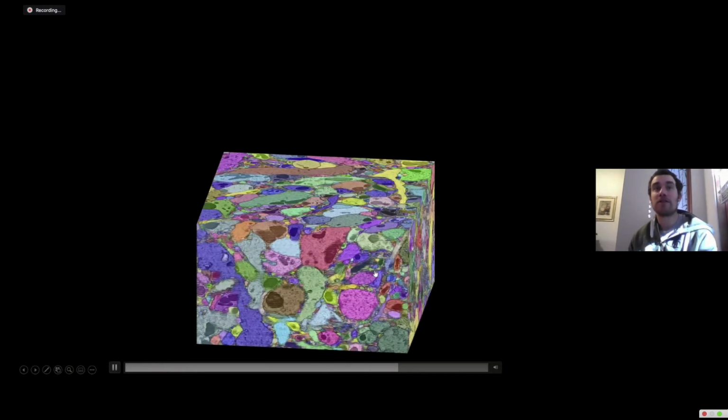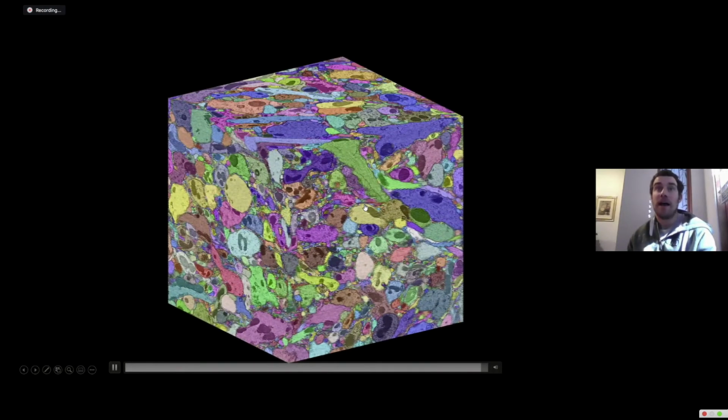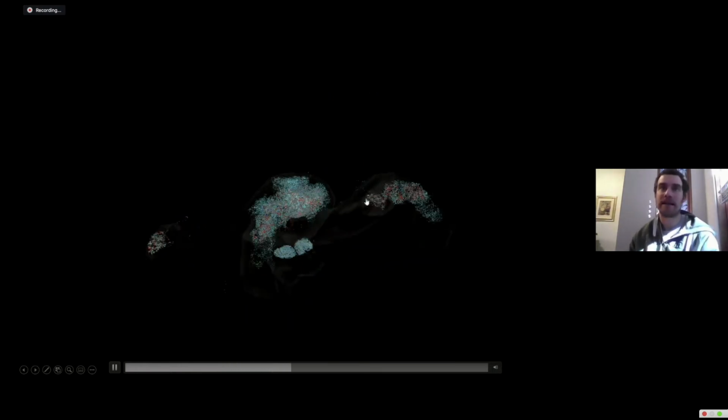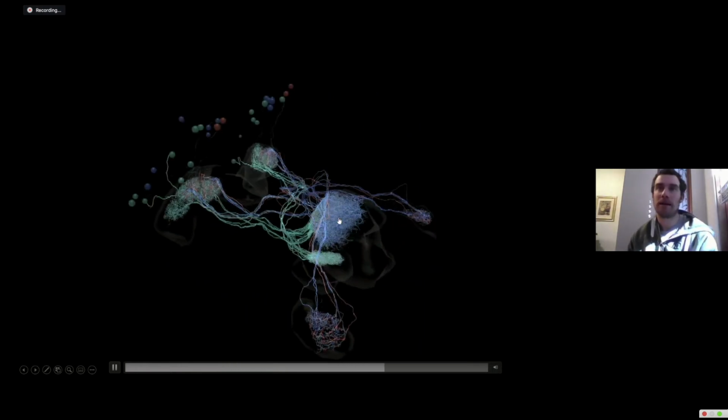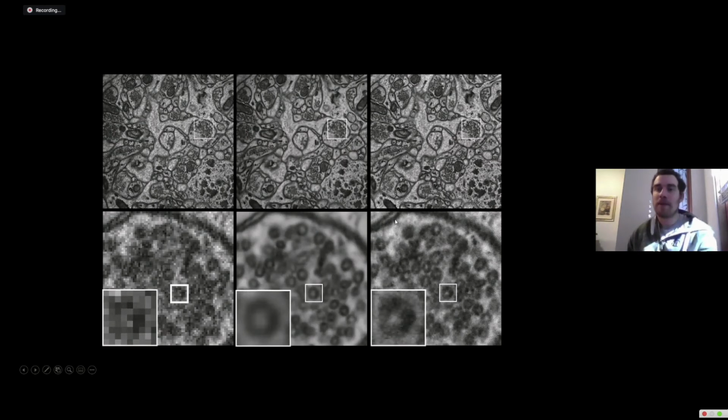In fact, one of the leaders in the field, Kristen Harris, has been building a saturated volume by hand for almost 20 years, and she's still updating it with detail to this day. But you can see that Arlo's algorithm can do this in a matter of minutes or hours automatically using the training data sets, and this can be extended to the whole brain, where we can determine in a fruit fly different projections from one region to another, and even calculate all the different synapses between cells from one region that project into another region. I encourage you to ask Arlo questions about how he did that in the chat.